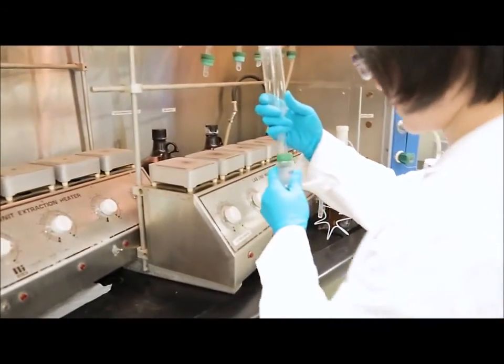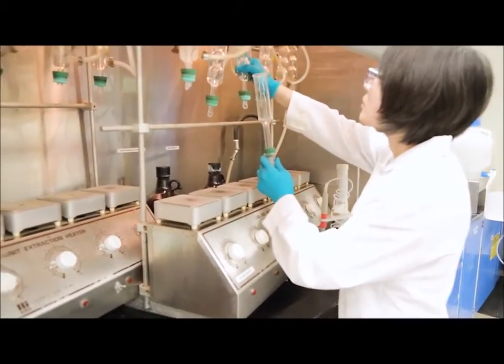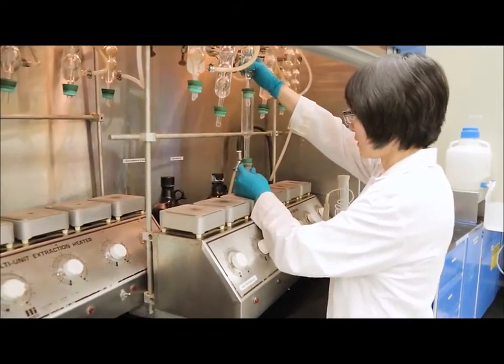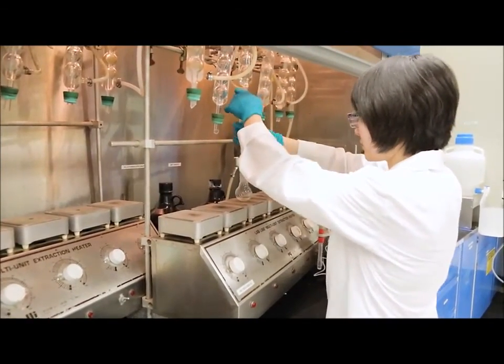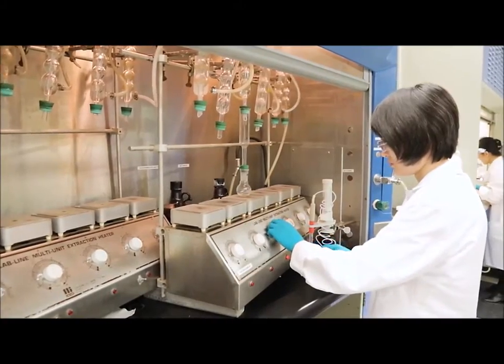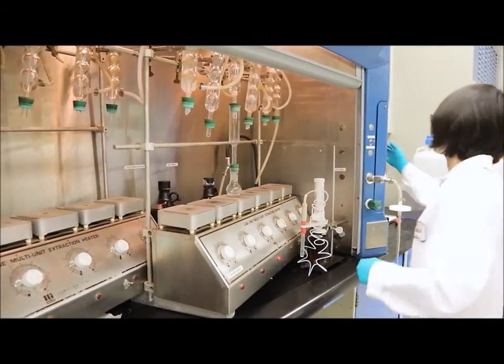Now we are going to attach the boiling flask to our apparatus. We use a connector to attach the boiling flask to the condensers. The condensers are going to have cold water flowing through them, and the heating pad is going to be turned to high temperature.